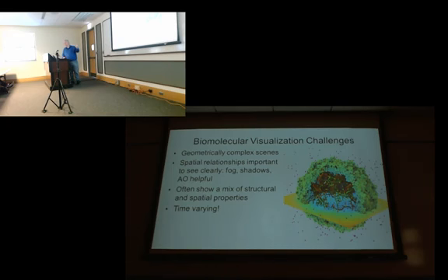But when you're making a figure for a publication, you can't do some of those things. You have a static image, it doesn't move, and so now you have a challenge.